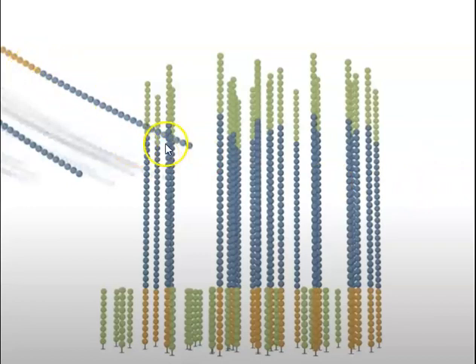So in the video we're at 1 minute 23 in the Illumina video, and at this point we've cleaved off one of those strands. So there's no point sequencing sense and antisense at the same time, because you would get C's and G's being flagged up at the same time, and you wouldn't know whether C or G was on the sense or antisense strand. So you cleave off one strand and just leave one single strand attached to the flow cell.